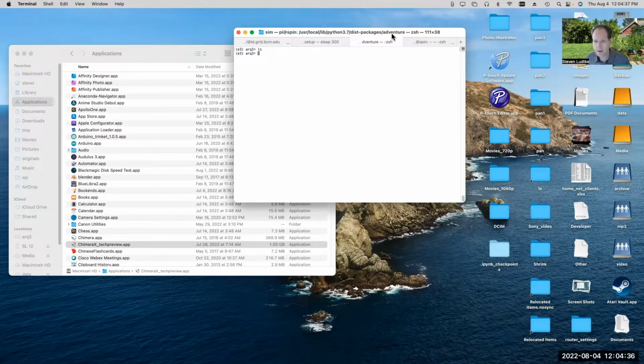So I thought we'd do something simple. There are lots of Python-based tools that you can use to manipulate PDB files or mmCIF files, whatever it is you care to work with. There's a similar package for crystallography developed in Paul Adams' group.